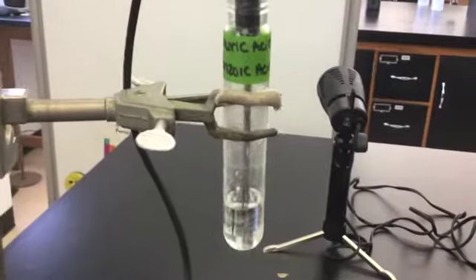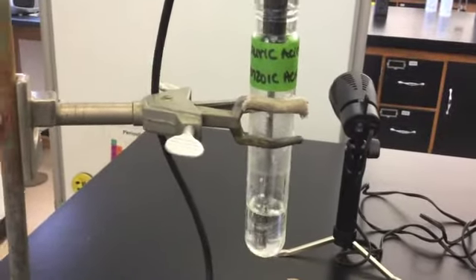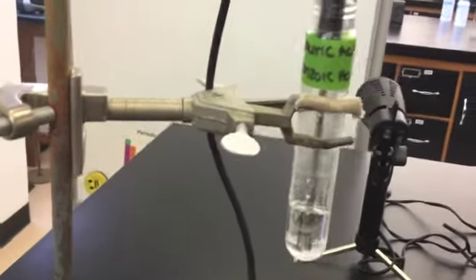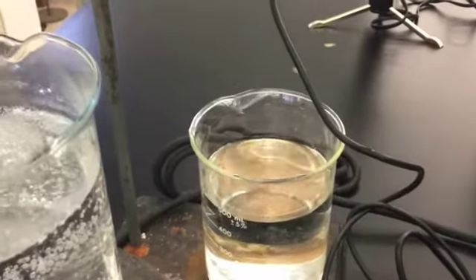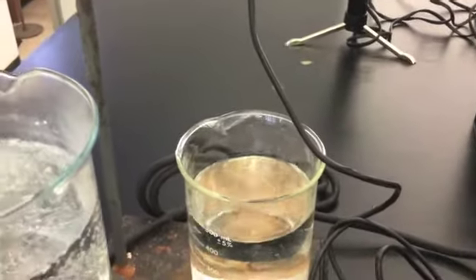Once this is stirred, remember it will take about 45 seconds for the thermometer or temperature probe to equilibrate to the temperature of the liquid. You will need to immerse the test tube into the cold or room temperature water bath and start the data collection. All the while, continue stirring.